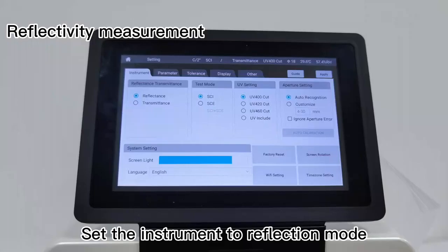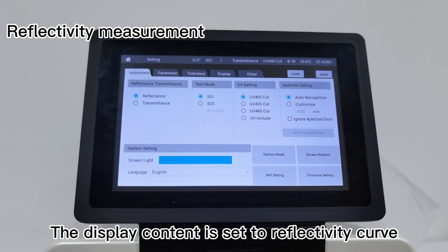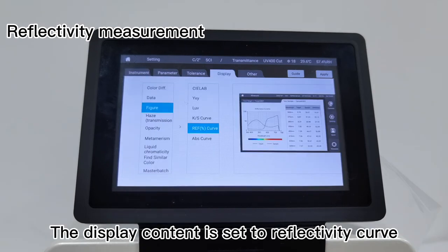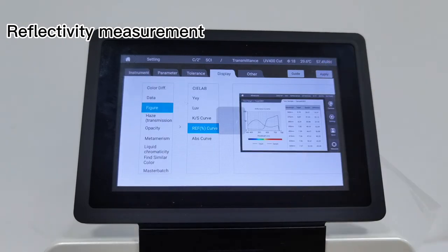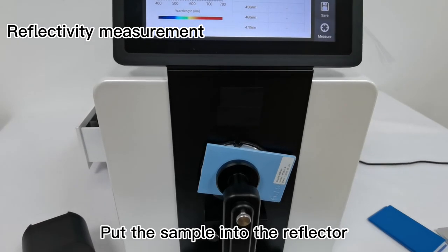Reflectivity measurement: Set the instrument to reflection mode. The display content is set to reflectivity curve. Put the sample into the reflector and carry out reflectivity measurement.